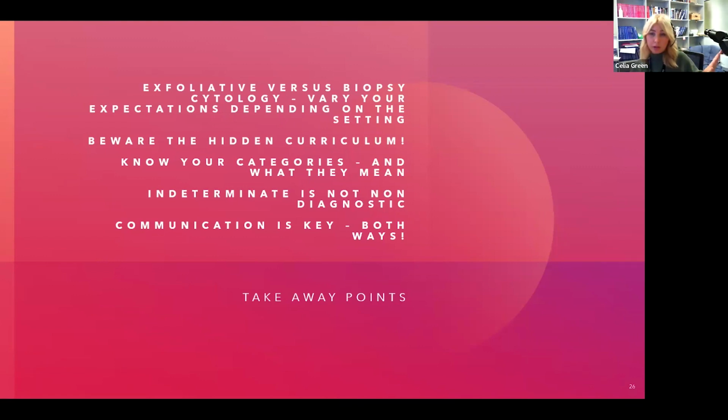I've got a camera on this microscope here. A lot of people have access to cameras. You can show each other cases in those sorts of ways. So yeah, it's certainly getting easier and easier in the digital age. It can give you a time delay.